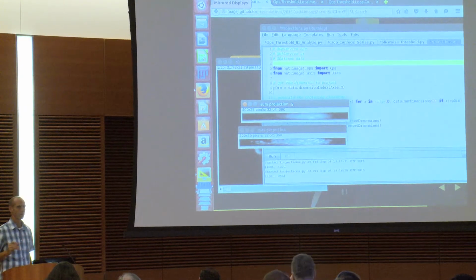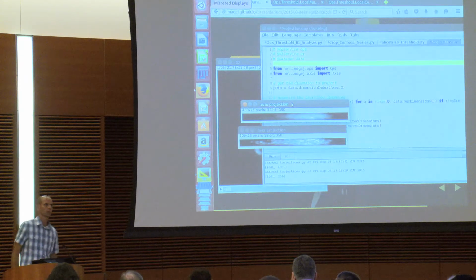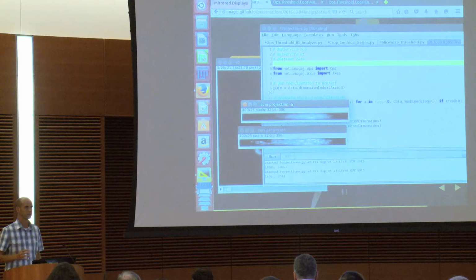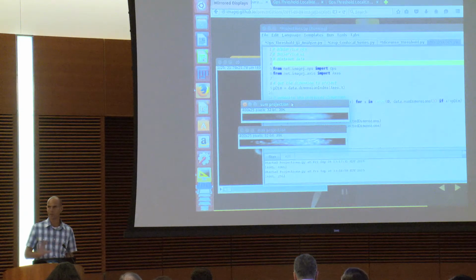A lot of the development of this project is sort of an exercise in starting from something really powerful, but kind of complicated, and then adding simpler ways to access it. So a lot of the work being done with these namespaces is adding simpler versions of the op, more signatures in the namespaces, so that you have easier ways to access this functionality. So this one, no question, is going to be much simpler next year, or probably maybe even next week. However, there will always be advanced functionality that you might want to take advantage of.